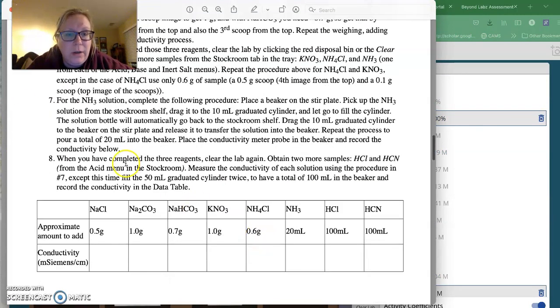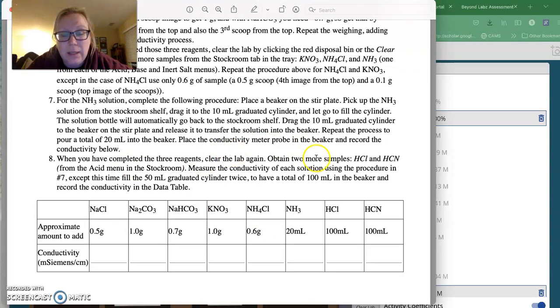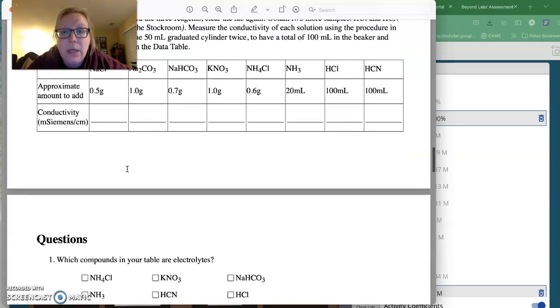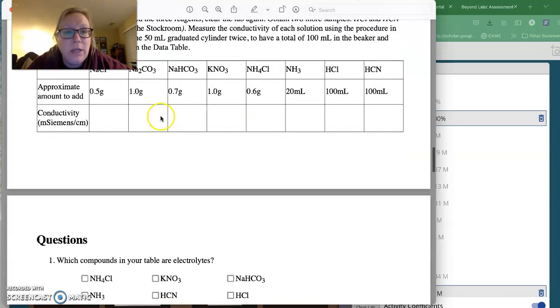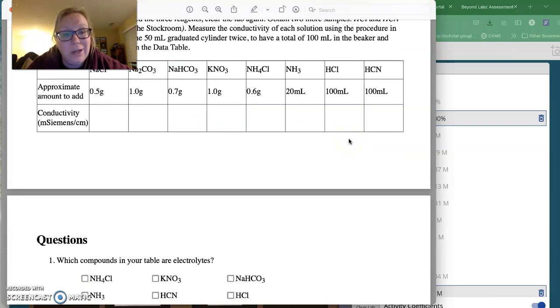Once you have completed those three reagents, you're going to clear the lab again and obtain two more samples, which is HCl and then HCN. Both of these are from the acid menu. You will test the conductivity and record the conductivity here.